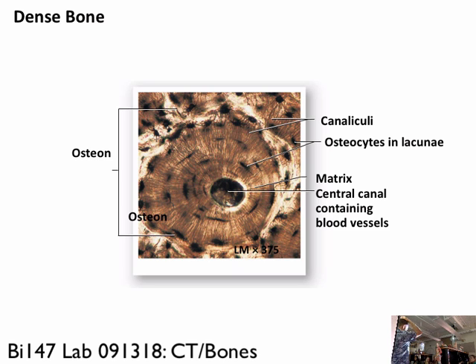Do I have canaliculi on there? Okay. Coming off of any of these osteocytes are these spidery, fine hair-like looking things. Those are super tiny canals. Canaliculi is like the Latin diminutive of the word canal. It's a Latin term. This means teeny tiny canal. And how do you remember it? Canaliculi. That's how you say it.